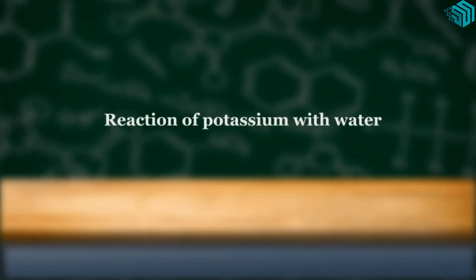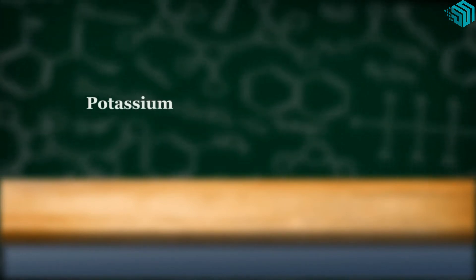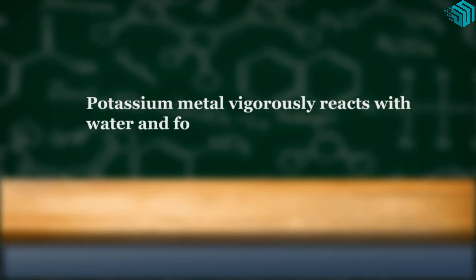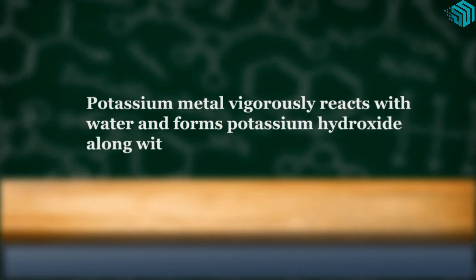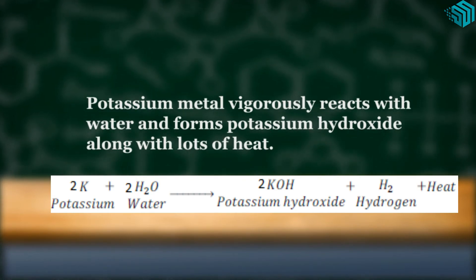Reaction of potassium with water. Potassium metal vigorously reacts with water and forms potassium hydroxide along with lots of heat. Potassium plus water gives us potassium hydroxide plus hydrogen plus heat.